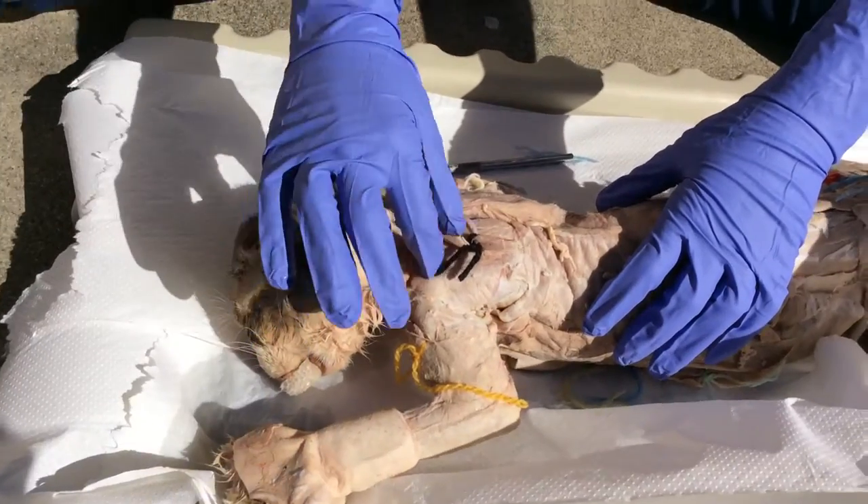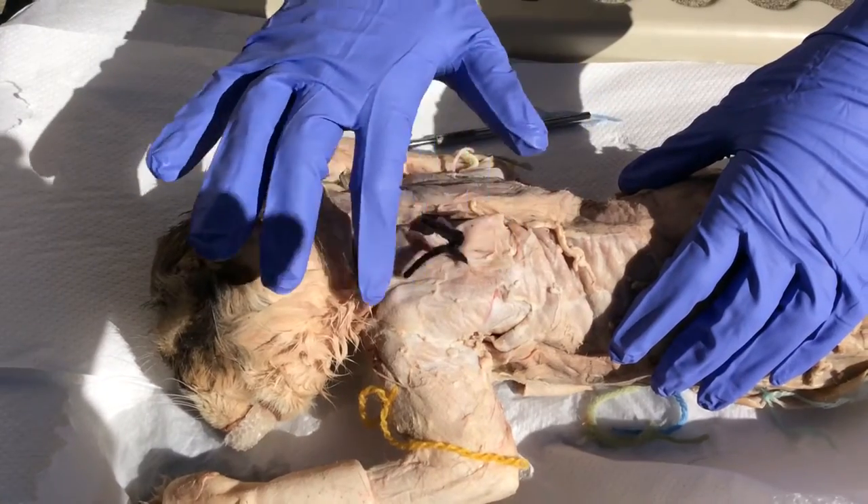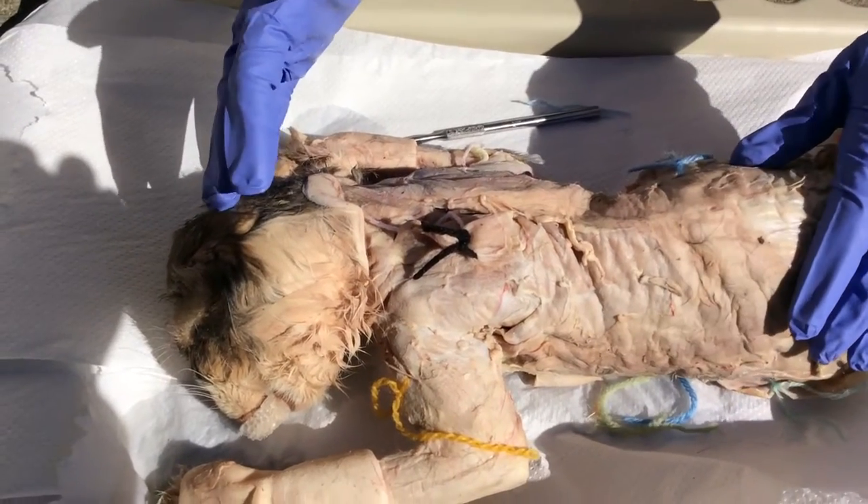Next is the trapezius in black, which elevates the shoulder. There are striations up and down, which allows the shoulders to elevate and move up.